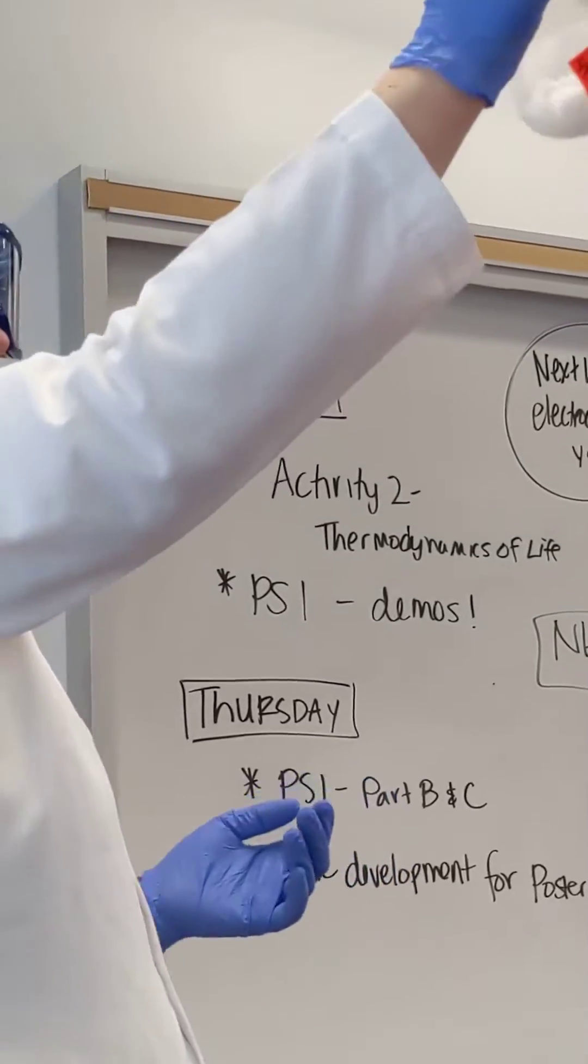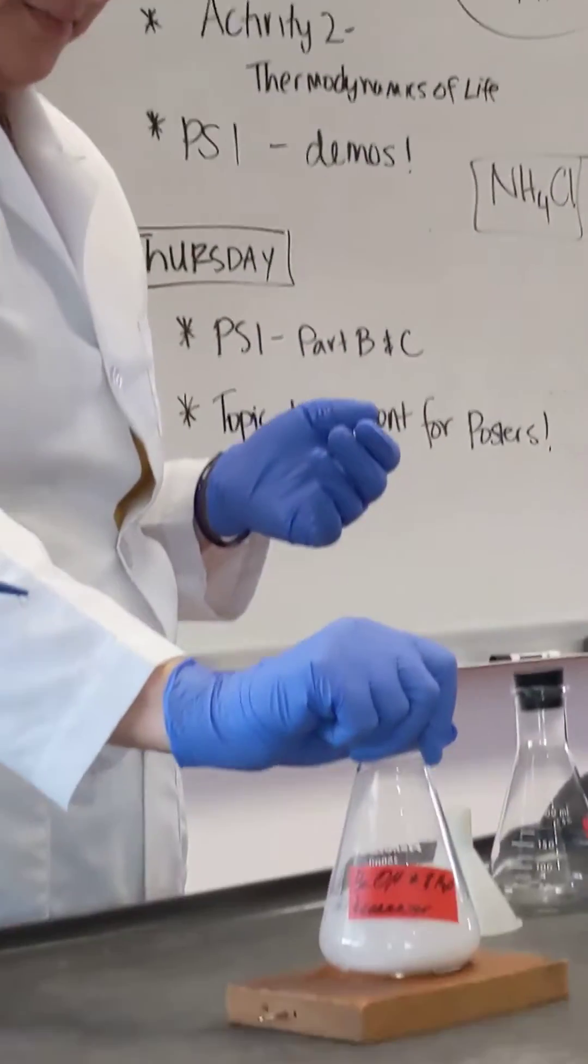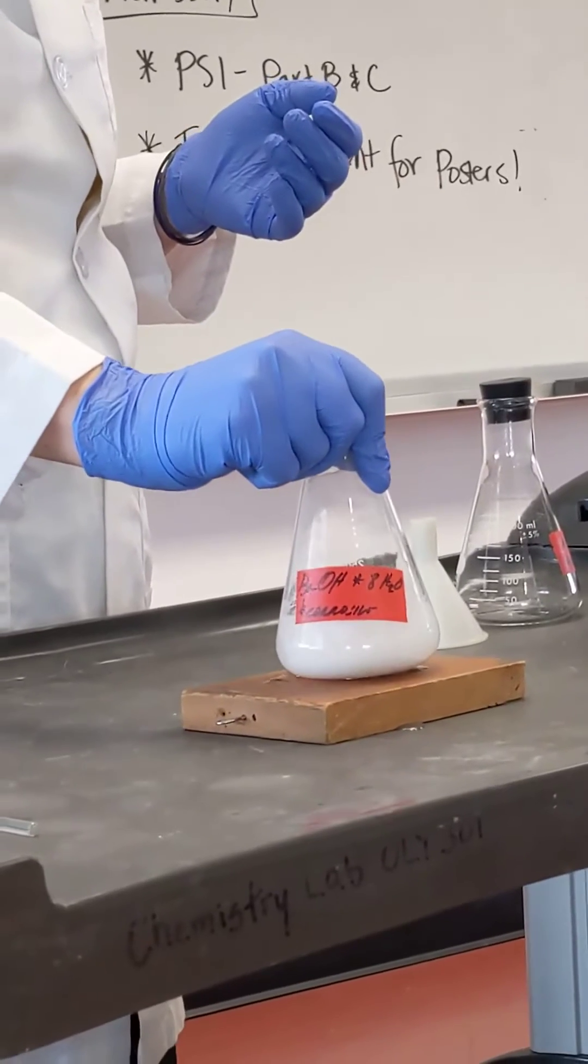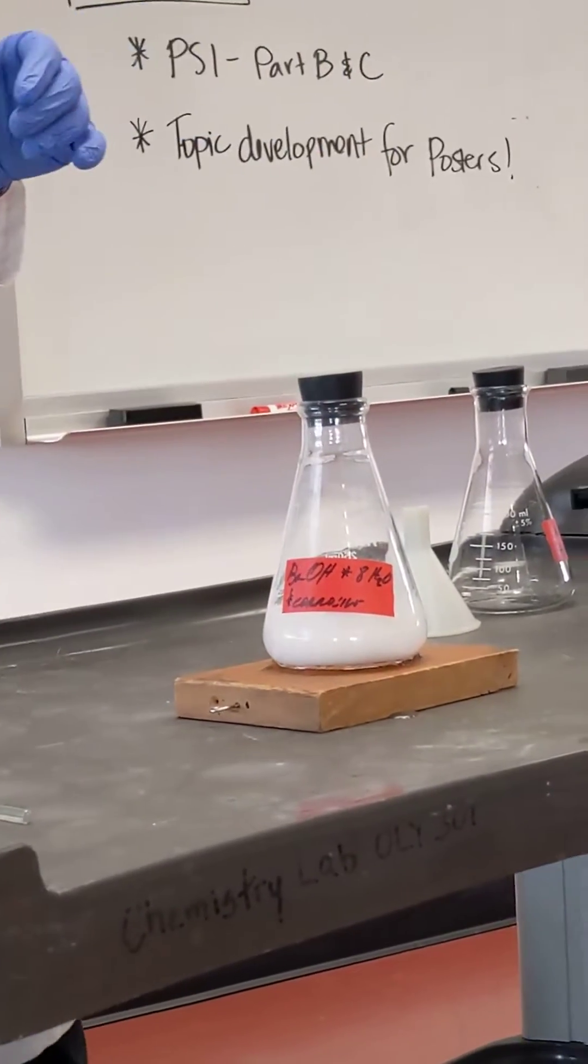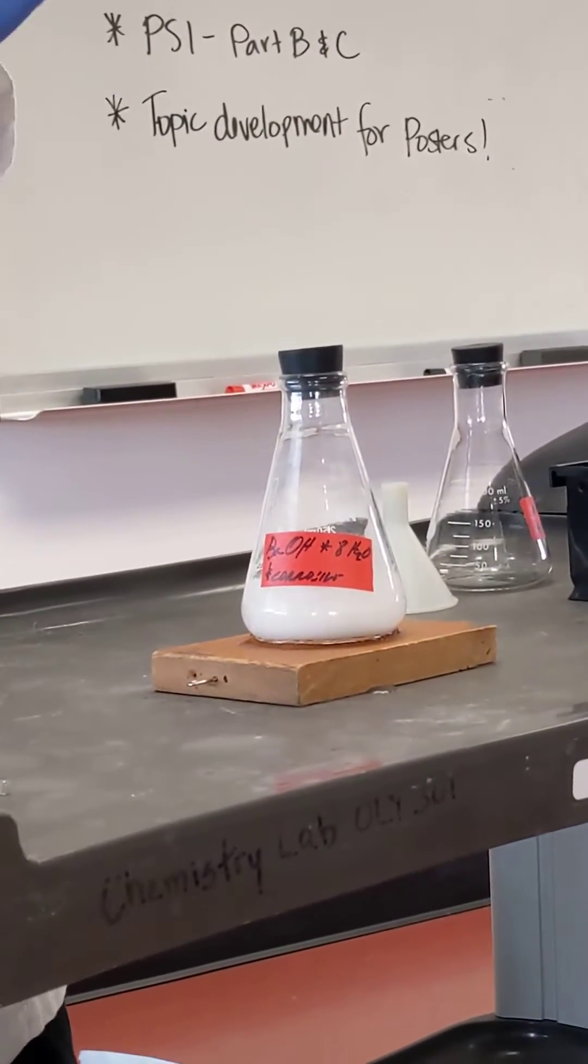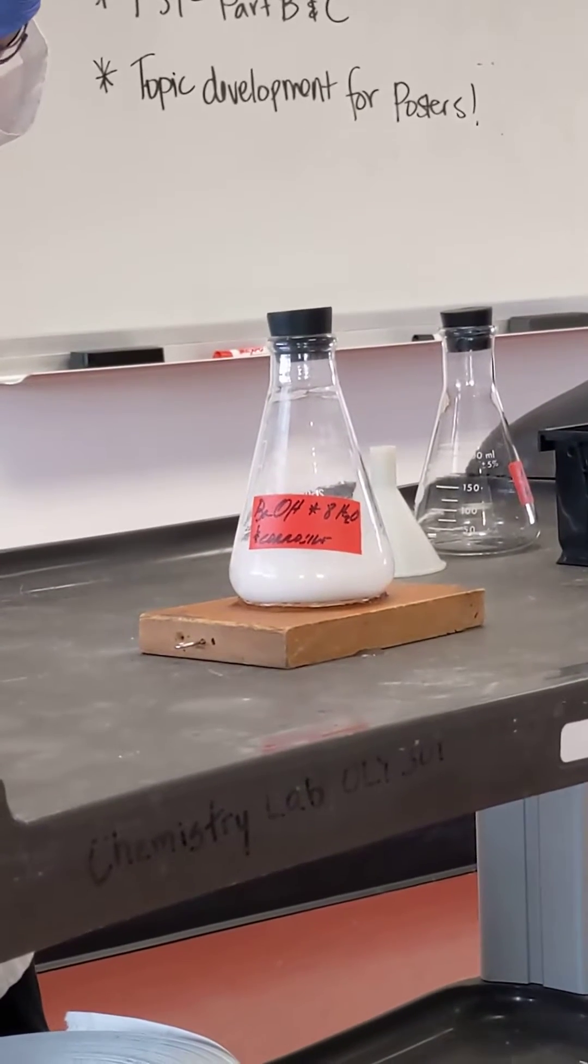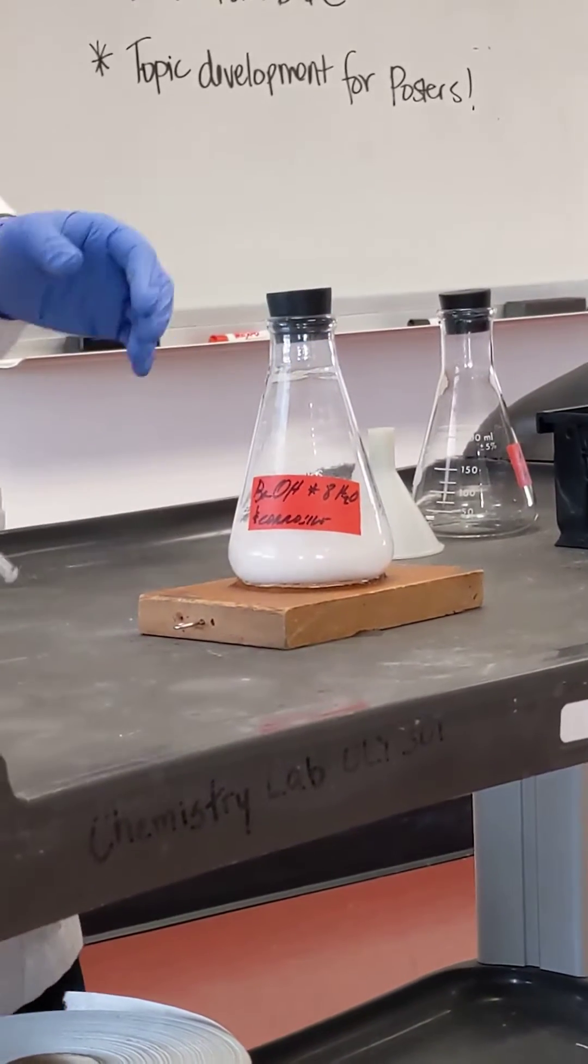So it's getting a little chunky. You see that? It's getting a little chunky. So this reaction is happening. It's a little bit liquid. It looks like a thick slurry, like I feel like I've had medicine that's this consistency.